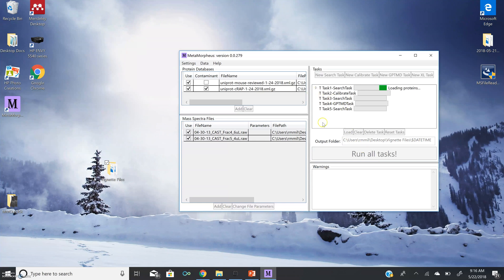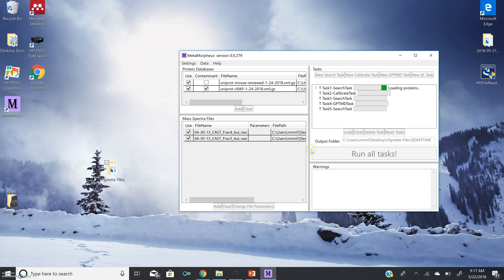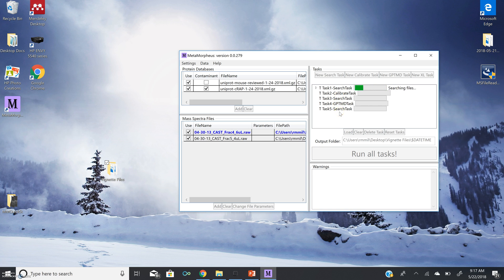Now this is not necessarily a conventional workflow for data analysis. This is developed to test the installation and show you the differing search results before and after calibration, before and after post-translational modification discovery.